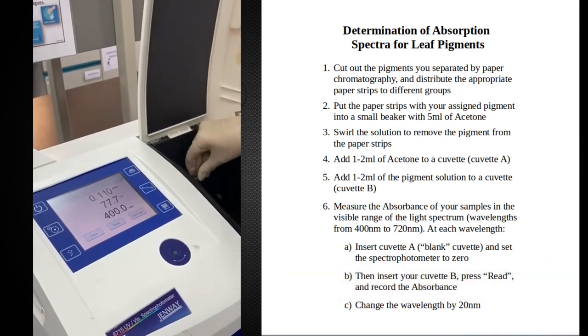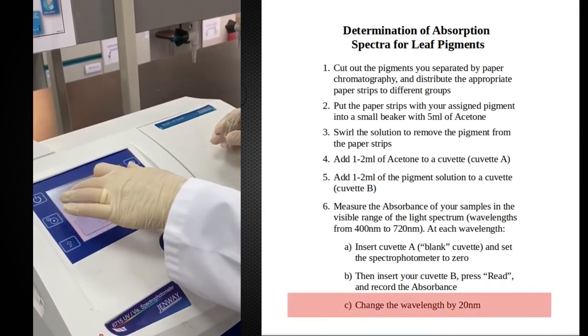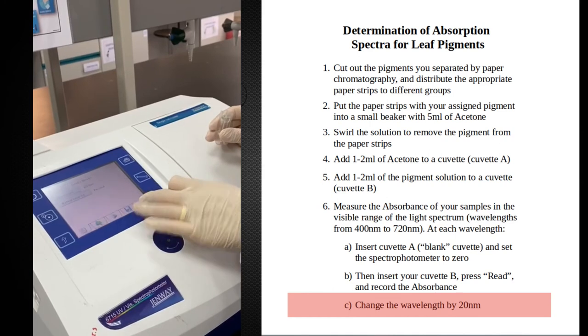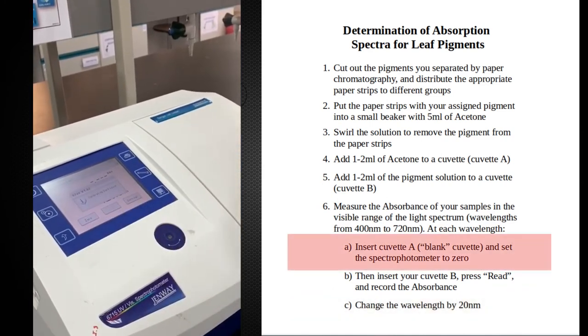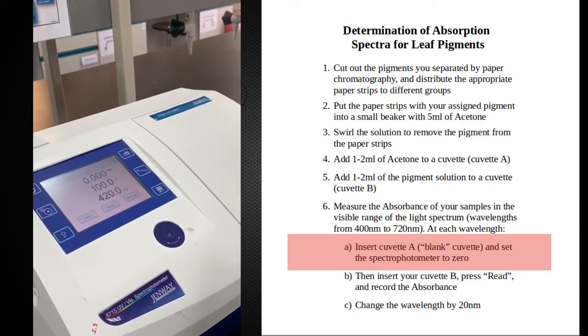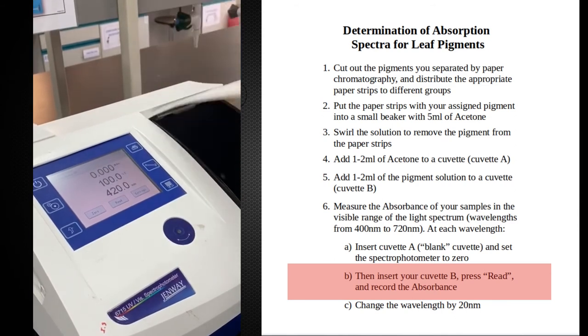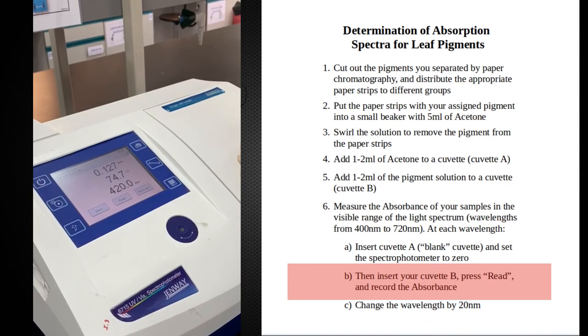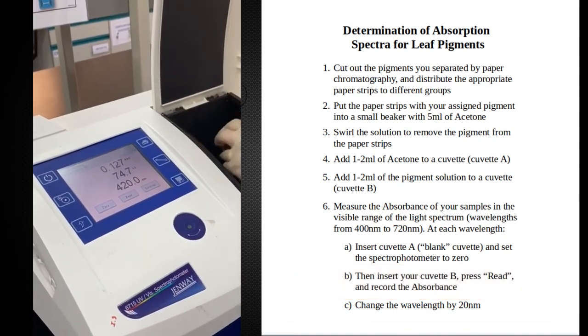I reinsert the acetone, change the wavelength, 420 is the next reading. Calibrate my spectrophotometer and then this is chlorophyll B again. Second reading is 0.127. I continue the same process.